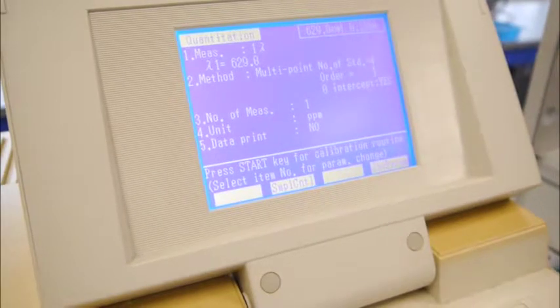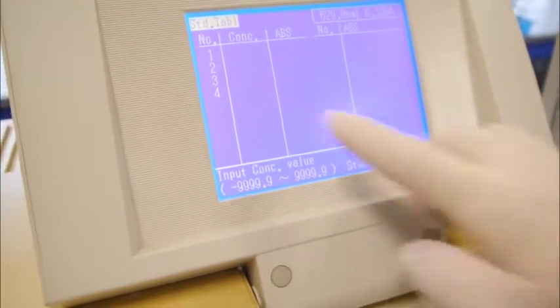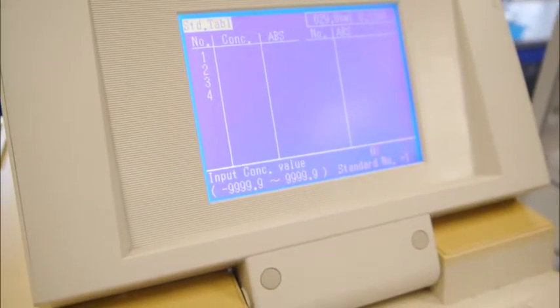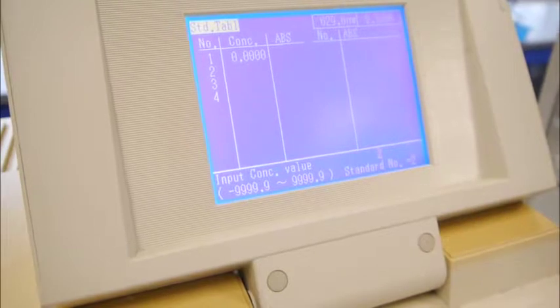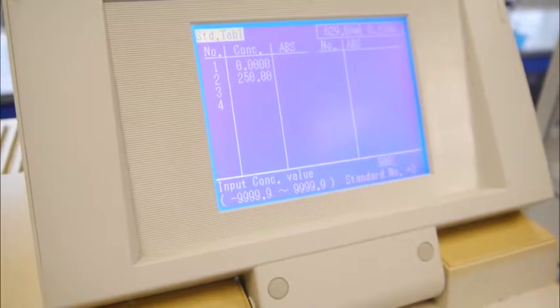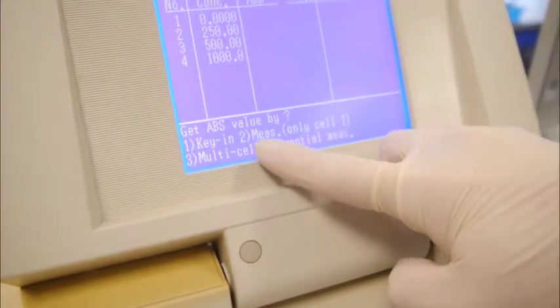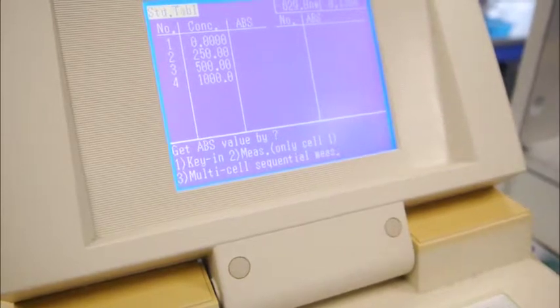Once you have done that, you will press start. You can then key in the concentration of the respective standard solutions. In this case, I will key in 0, which is my standard 1 — the blank — followed by the second standard at 250 ppm, the third standard at 500 ppm, and the last standard at 1000 ppm. Once done, I need to press 2 to command the machine to measure the cells.